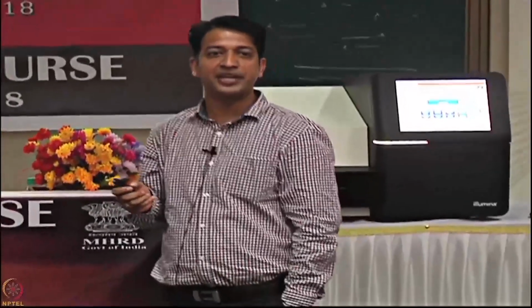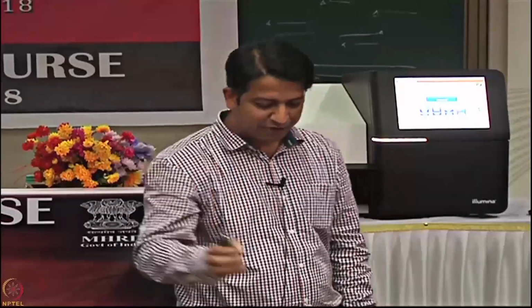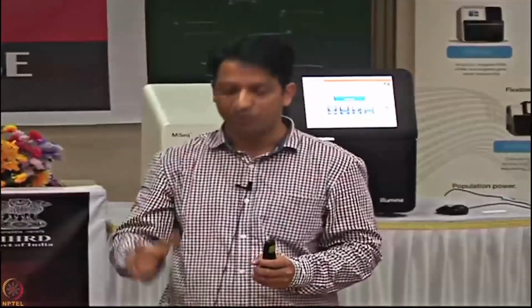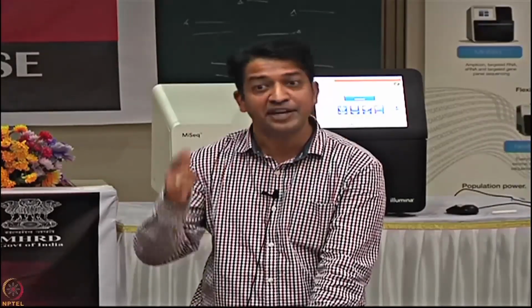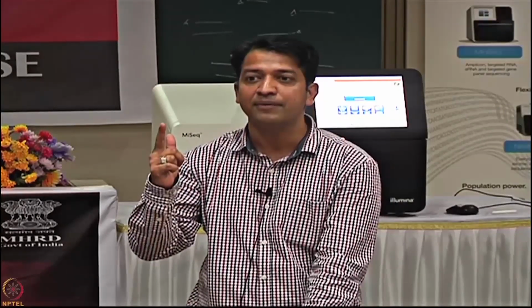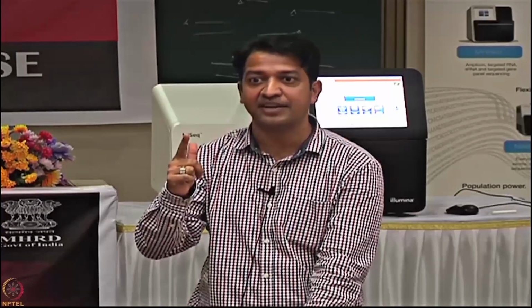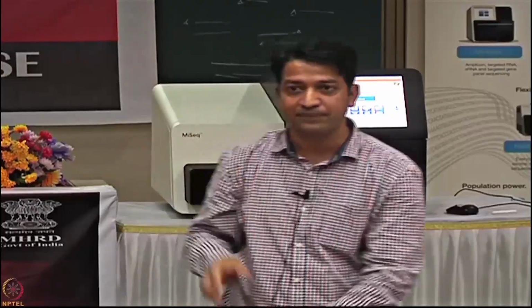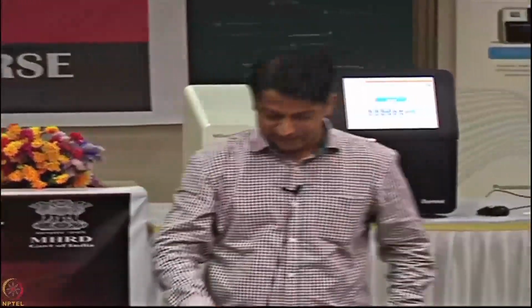If I say Q30, what is Q30? Let's say you performed a run which contains an E. coli genome. We will define that 80% of the bases sequenced were above Q30 values. Getting it? So the accuracy rate in those 80% of base calls was 99.9%. Not error rate, accuracy rate. The error rate was 0.1%. Am I clear?